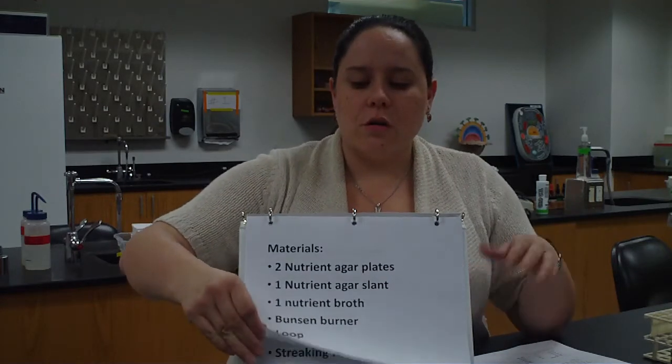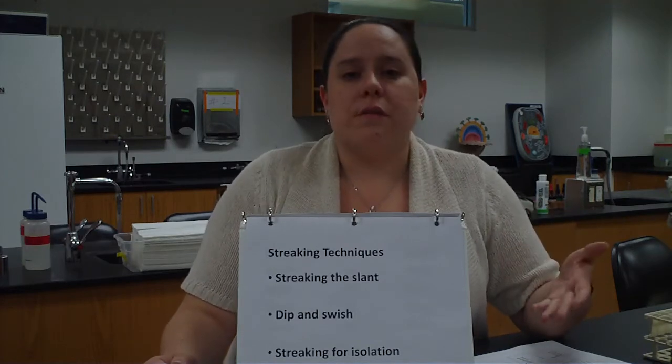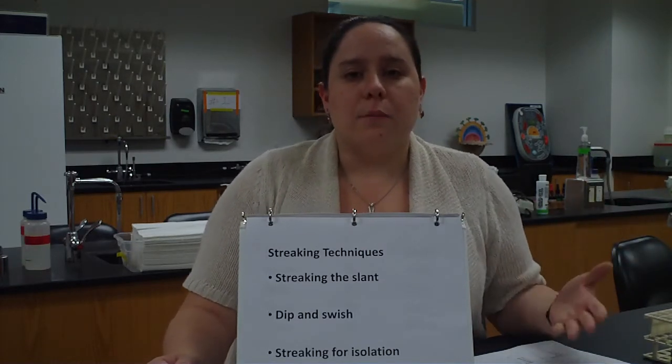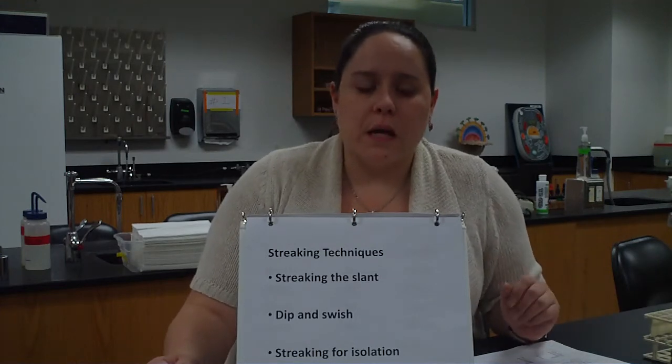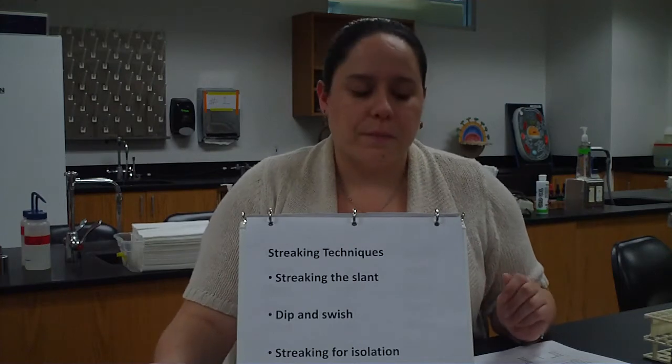The particular streaking techniques that we're going to be showing you today are streaking the slant, which we'll use for our slant media, dip and swish that we use for broth media, and then finally streaking for isolation, which we use for our plates.